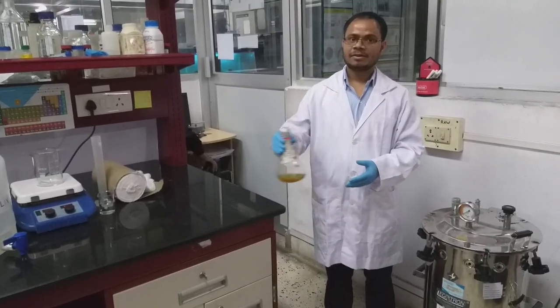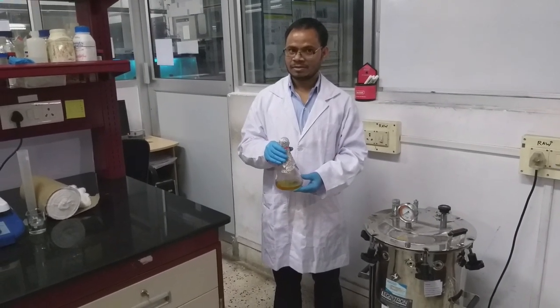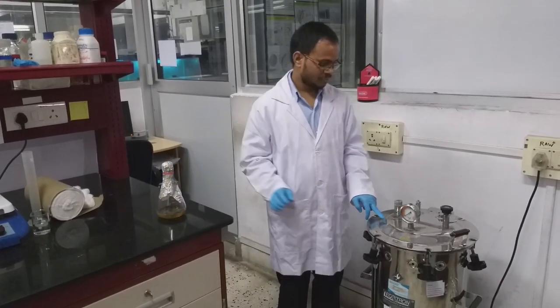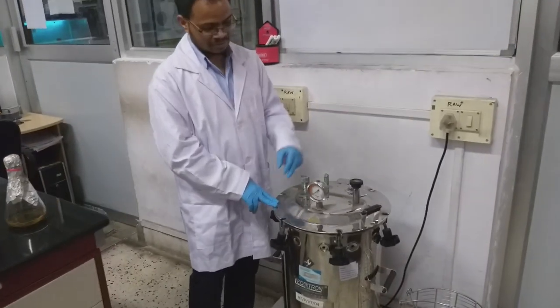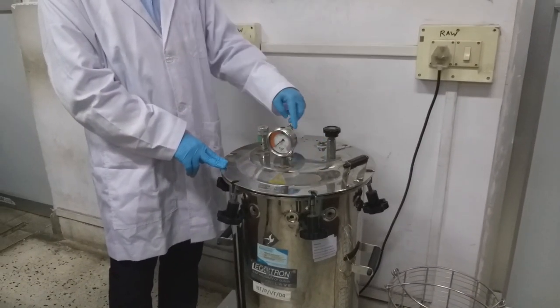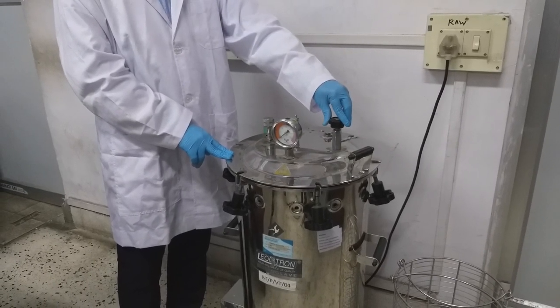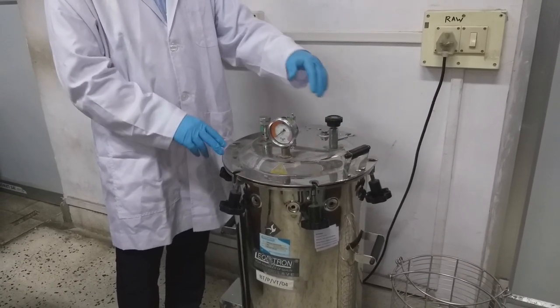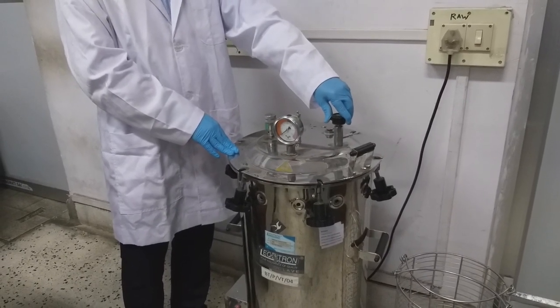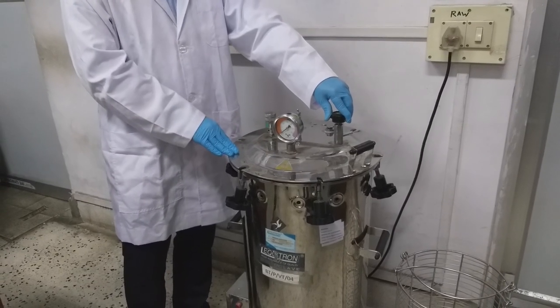autoclaving. Once the media preparation is complete, we have to sterilize the media in order to use it for further applications. This is a typical autoclave where you can see temperature and pressure indicator, and these are the pressure knobs, and this one is the quick pressure release knob. You can use it when you are in a hurry, but I will prefer not to use this one. Let it go on its way.